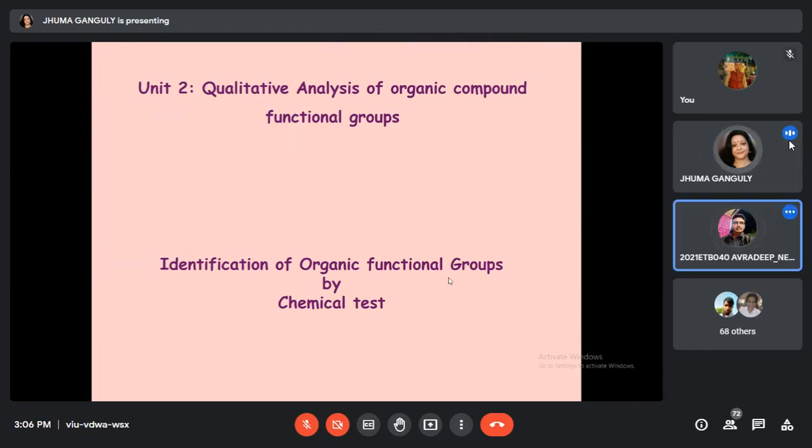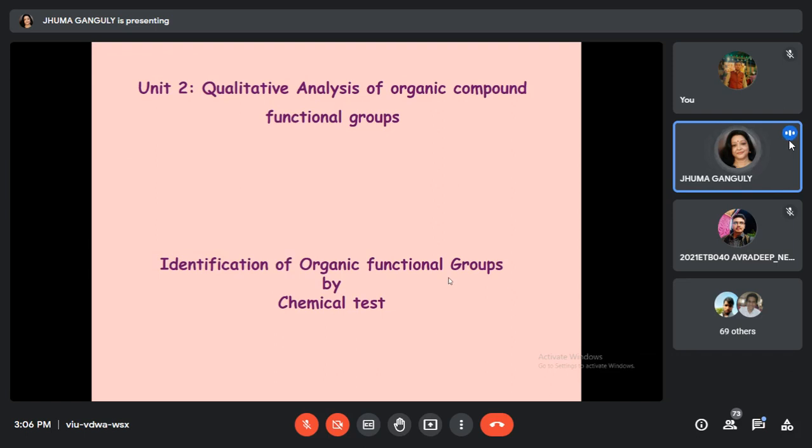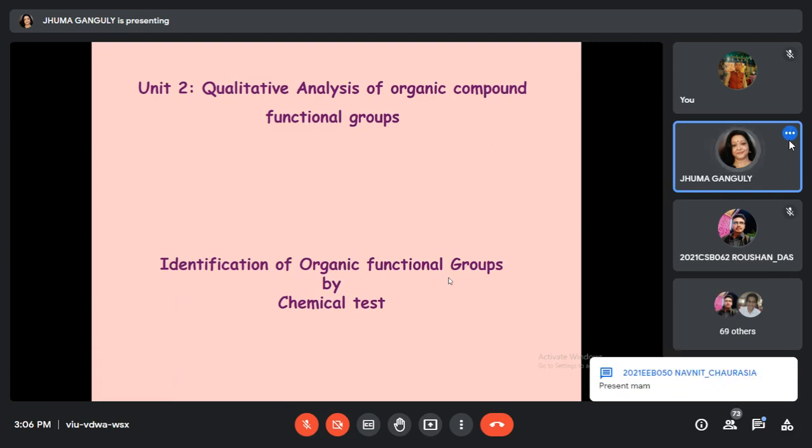Excuse me, ma'am. Why is disodium salt used instead of EDTA? EDTA, ethylenediaminetetraacetic acid, is actually very sparingly soluble. This is a big molecule, and ethylenediamine means it has an NH2, CH2, CH2, NH2 moiety, some aliphatic chain, and it is difficult to dissolve in water. Acetic acid is also not a very strong acid. So this whole moiety, because of its organic nature, is not very soluble in water.